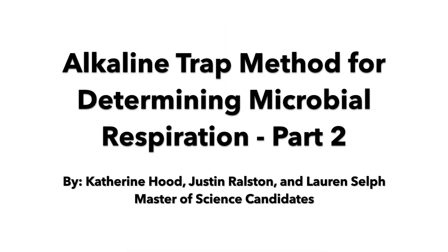The alkaline trap method is a simple laboratory procedure useful for quantifying microbial activity in soil by measuring respired carbon dioxide.